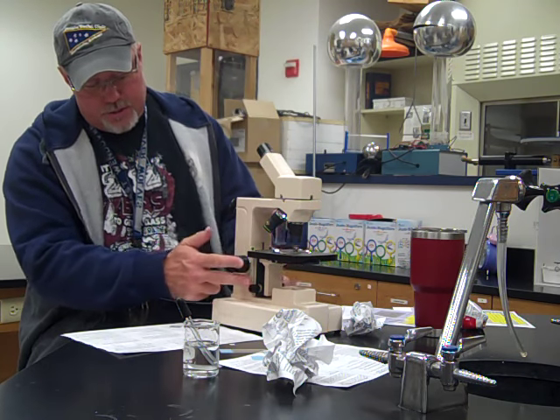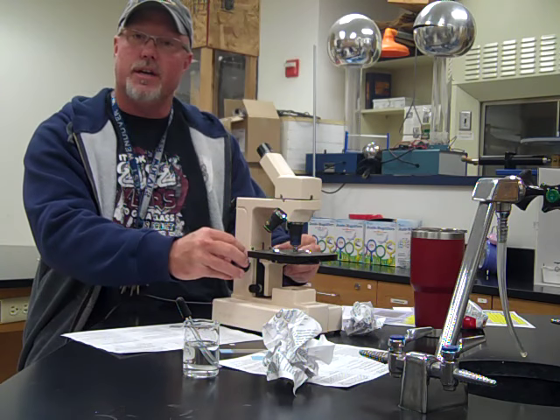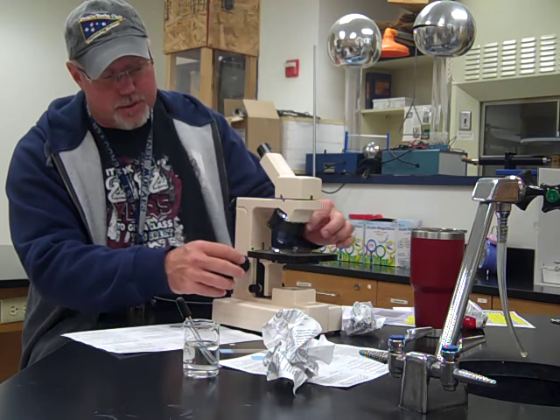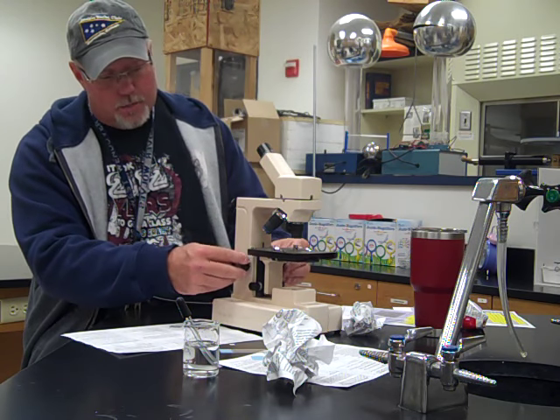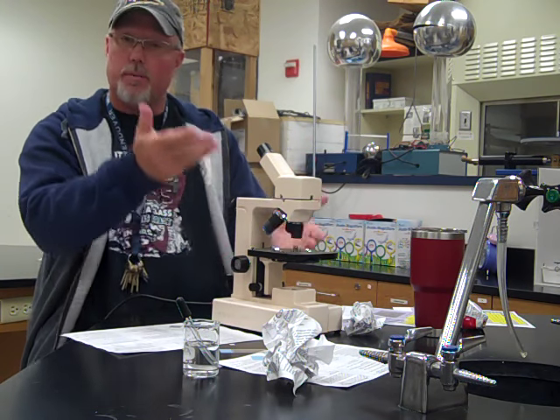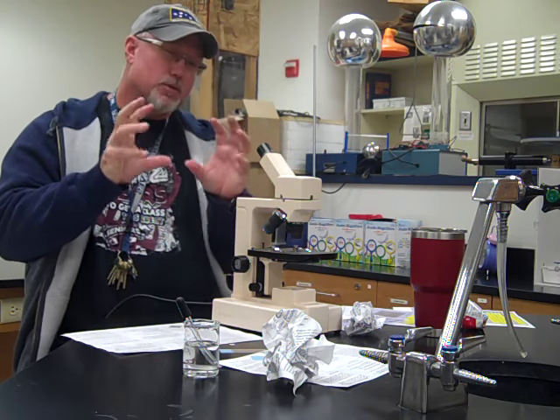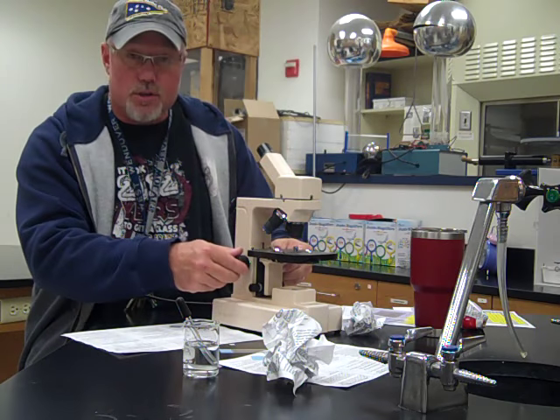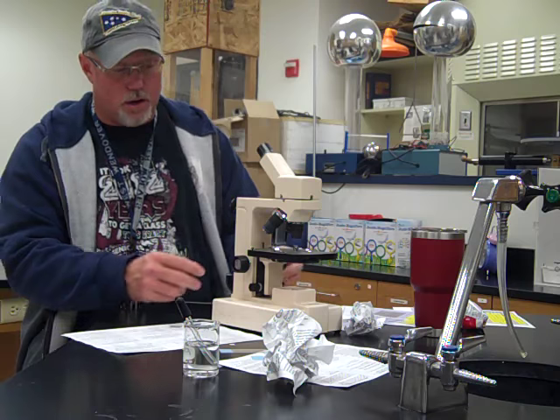Next to the light source and right behind the stage are 2 wheels. The biggest one here is what we call the coarse adjustment. The coarse adjustment is only used when you are on low power, because your stage moves the biggest amount, and we do not want to be doing that when we have the medium or the high power on. Sometimes with medium power, depending on how much distance you have, you could use the coarse, but mostly you won't want to use it when you have high power on.